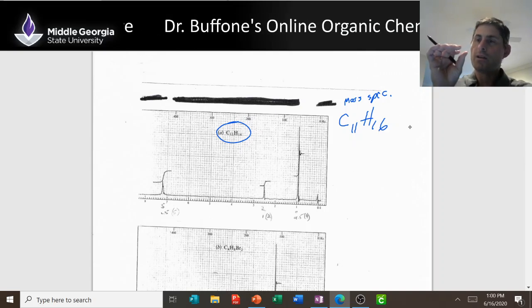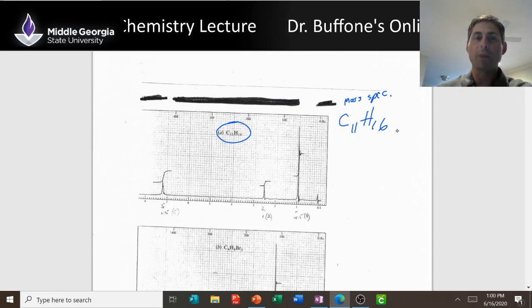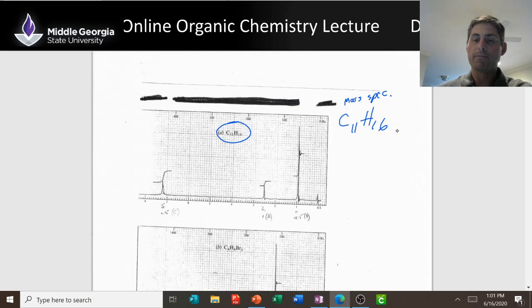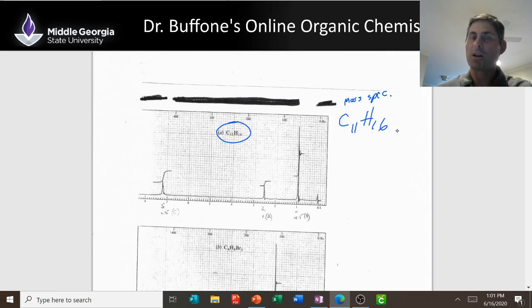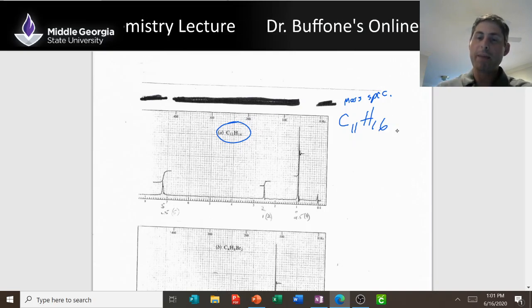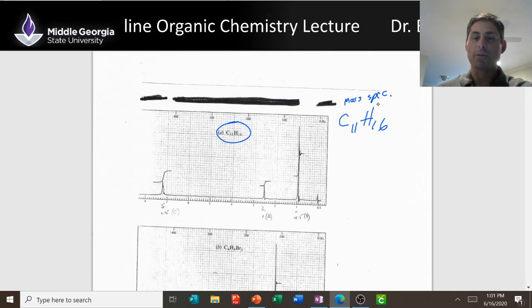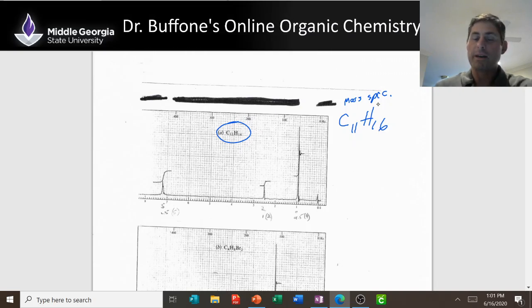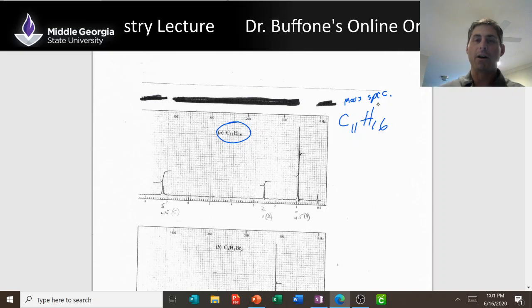So you take a liquid, it's an organic compound, you run it through a mass spec, you get elemental analysis, you get the molecular formula, but you have no clue of what type of structure you have here. You can run this through the IR to take a look at functional groups, but you're not going to get from the IR, unless the molecule is very simple, lots of information about atom connectivity in your molecule. So you take mass spec, IR, and you combine it with NMR, and now you can nail down the chemical structure, the atom connectivity of your molecule. And sometimes you can actually characterize and determine the molecular structure based on just NMR alone. But it's actually best to have a combination of mass spec, IR, NMR.